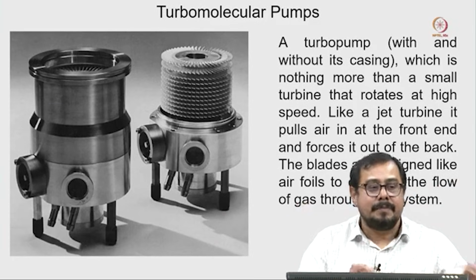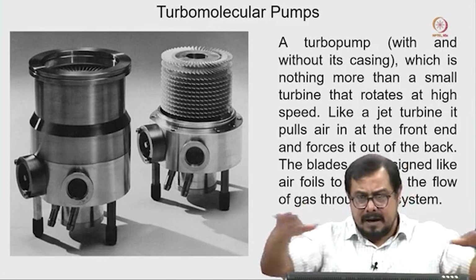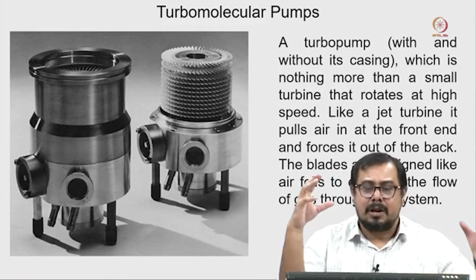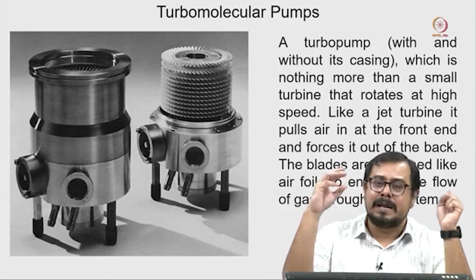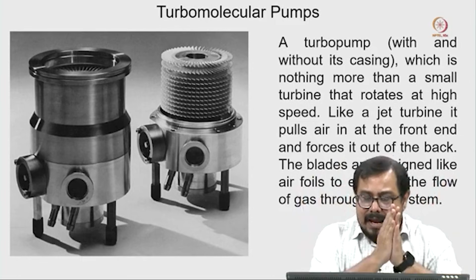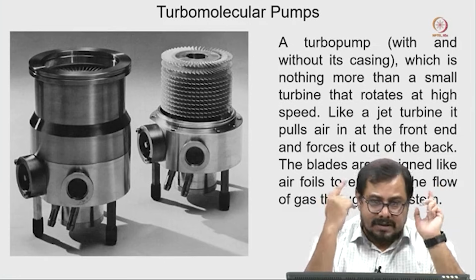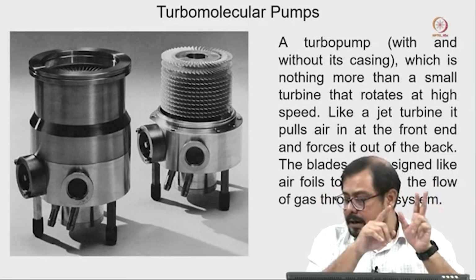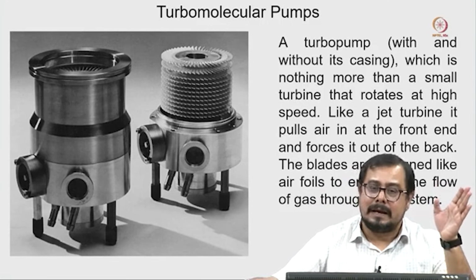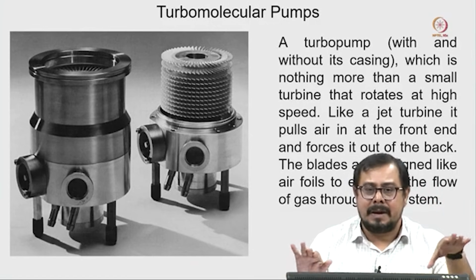So, this pump works from normal air pressure to a very high vacuum. Generally, it is connected where we insert the sample, because that is the one area where we break the vacuum on a daily basis. So, we need a pump system which will start immediately when you insert the holder and throw out the gas and air molecules from the microscope.